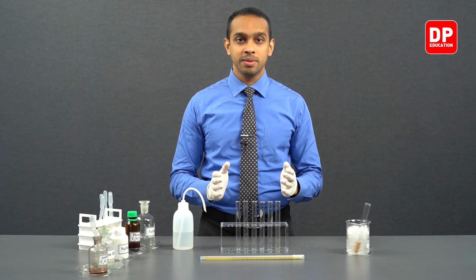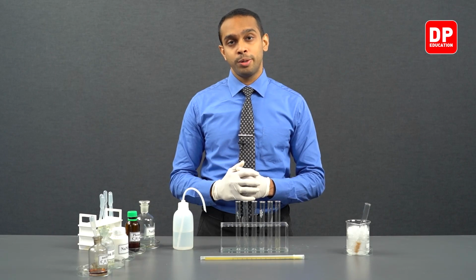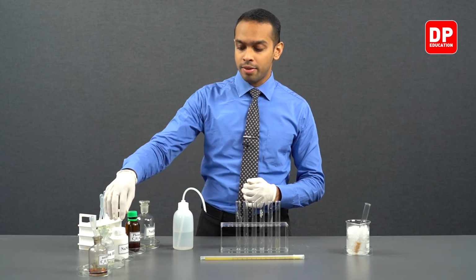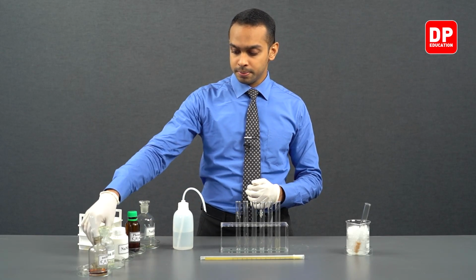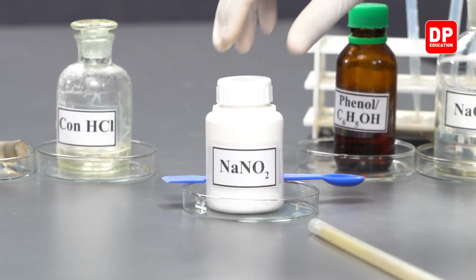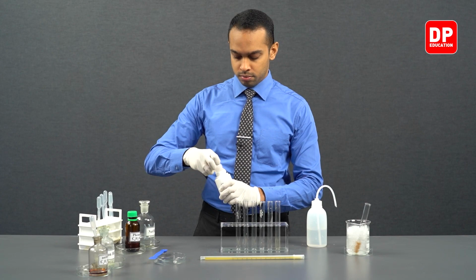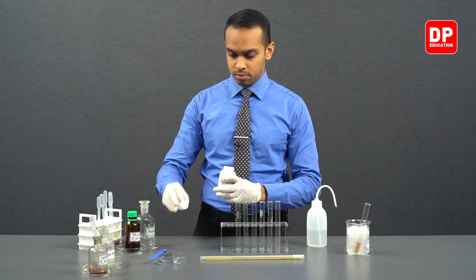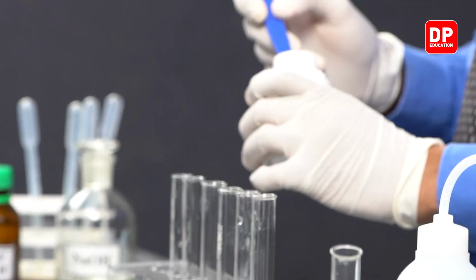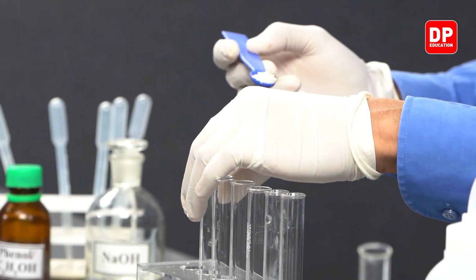After dissolving aniline in concentrated hydrochloric acid, we are now going to take sodium nitrite and dissolve it in water. We have our sodium nitrite over here. We'll take a small sample of sodium nitrite. We'll transfer it to a test tube.